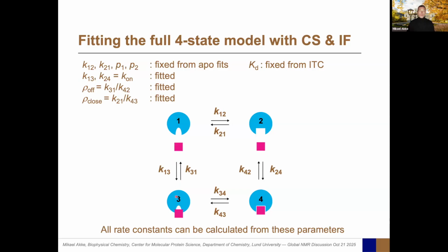And whatever is happening here, all of this is included. So going from the ligand being somewhere out in solution to finding its way and then searching the surface of the protein and finally docking, all of that is included in this on rate, and we assume that it's the same for the two pathways.